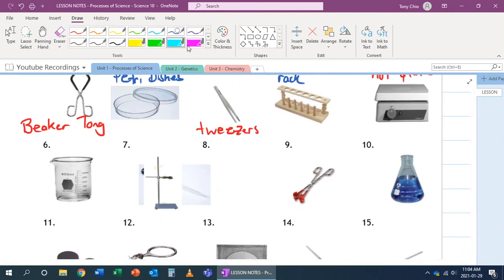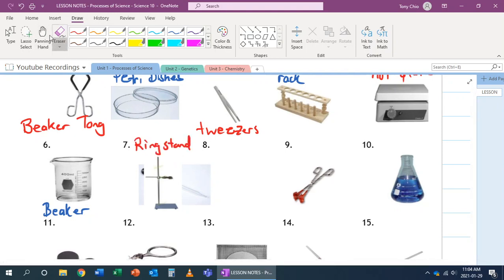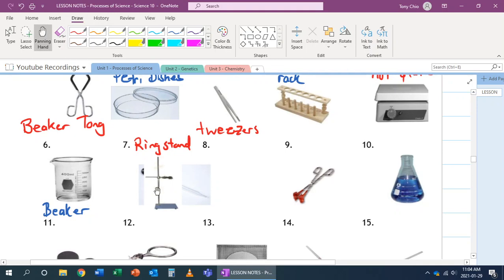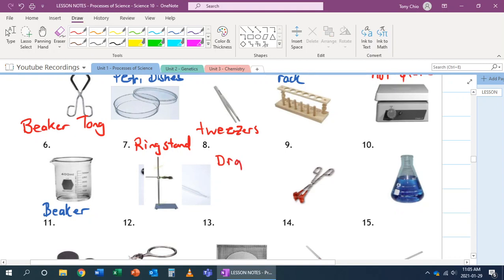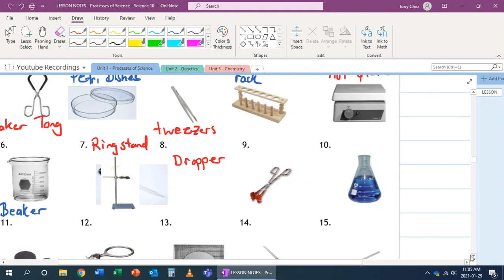Number six. Number six is called a beaker. It is used to temporarily mix and hold solutions. Number seven is actually this one right here. This is called a ring stand. And what you do is you can attach many different pieces of equipment in order to conduct experiments and hold them together. Number eight is actually the one behind, and that is our dropper. It's used to dispense and transfer liquids.